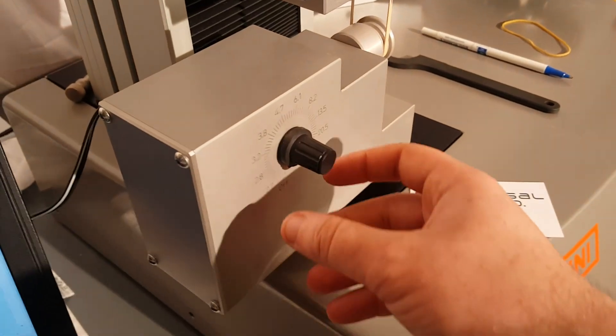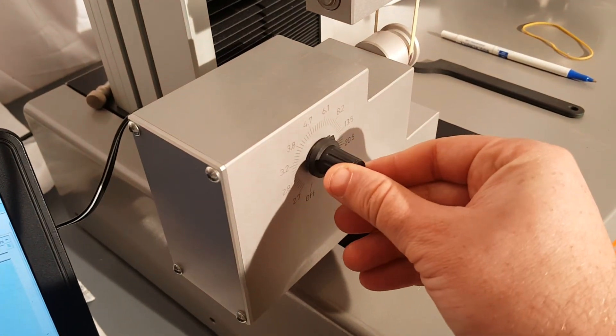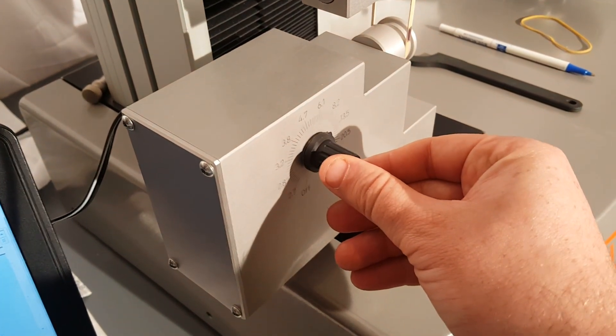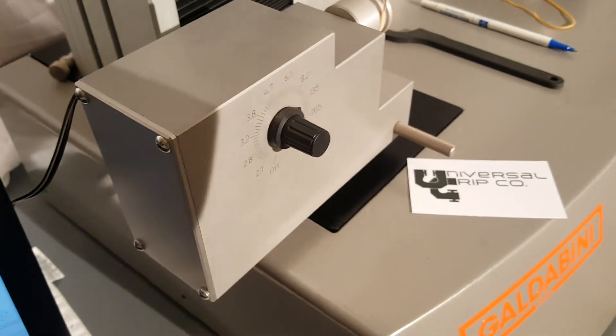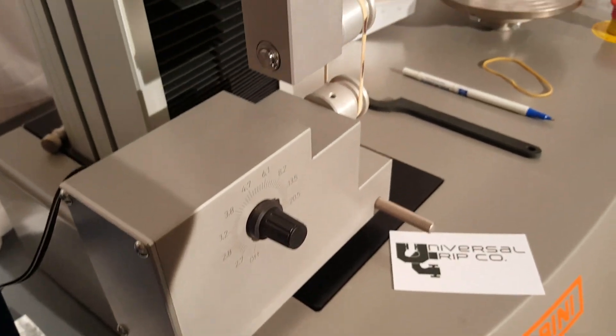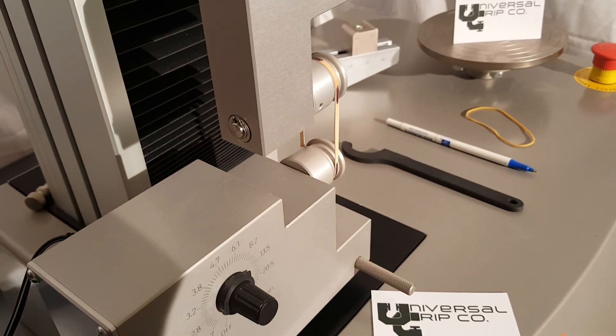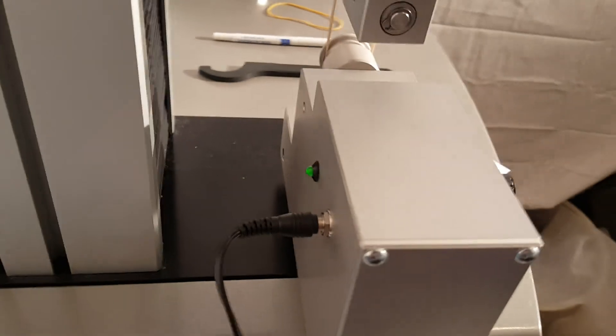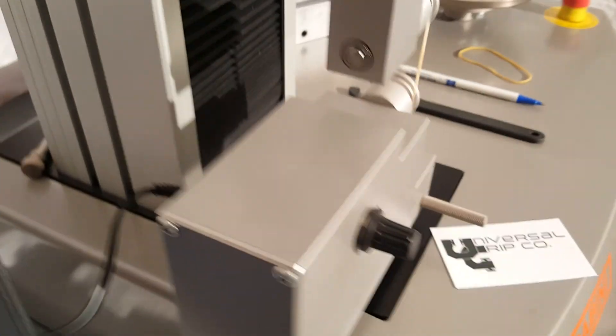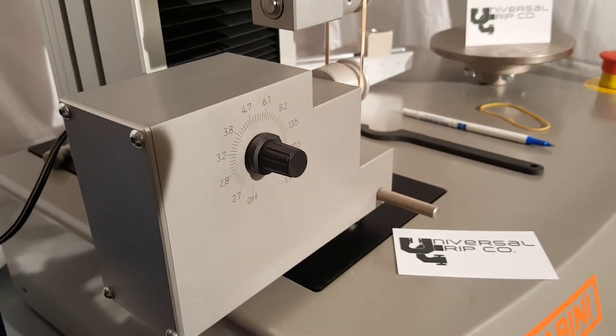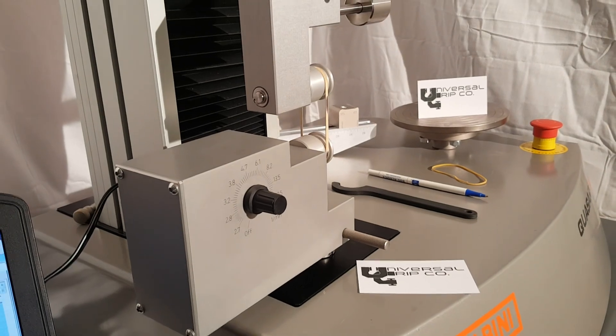We'll go ahead and turn this on, up to about 13 rpm or so. You can see the motor's rotating, and I know it's on and working because the green light on the back here is lit.